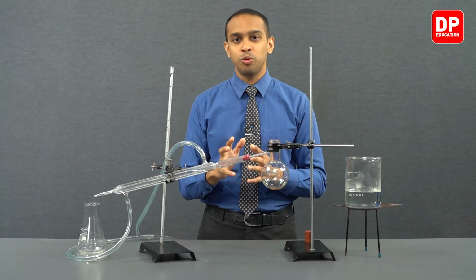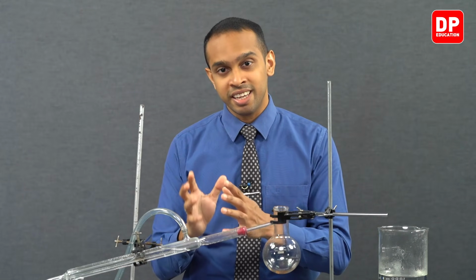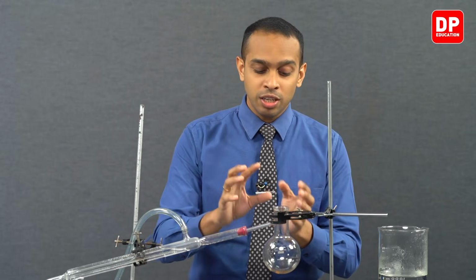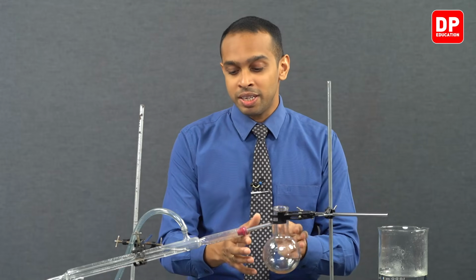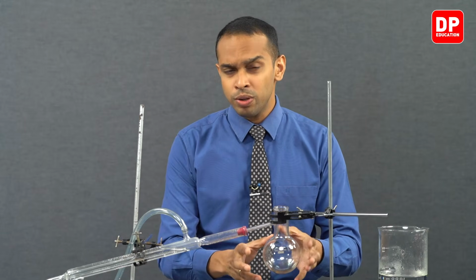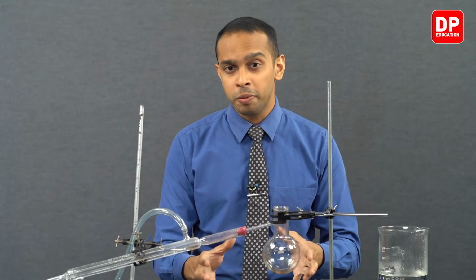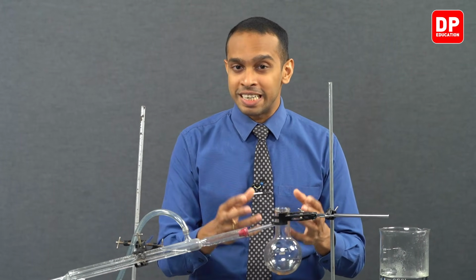So after removing all water, we use this diethyl ether layer that contains the essential oil and we transferred it into this distilling flask. And we carried out a simple distillation over here. As we carried out the simple distillation, we saw the component, out of the two components, that has the lower boiling point got boiled off first.